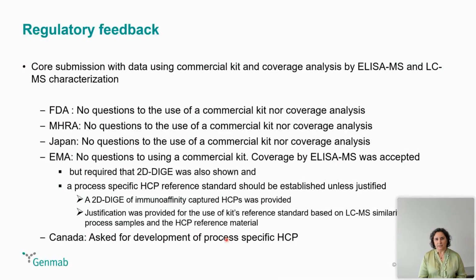We filed our specification method with a commercial kit, and we showed the coverage analysis by ELISA-MS supported by LC-MS characterization.